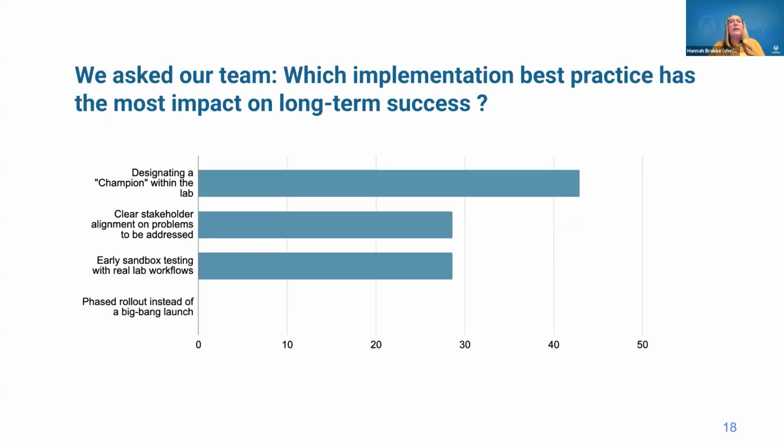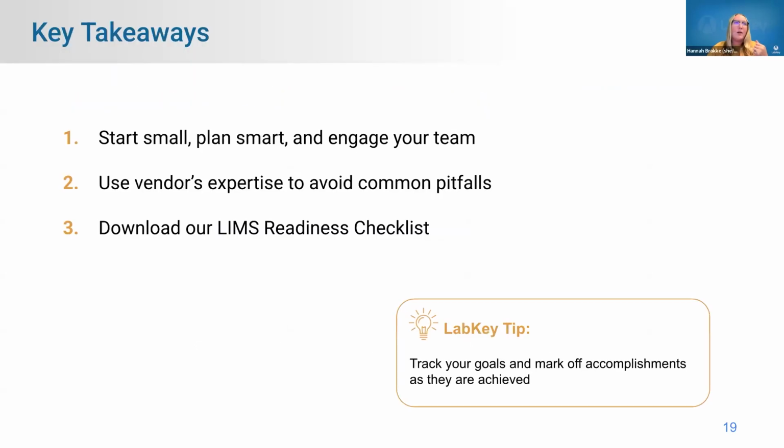And so the last thing here as we're closing, I asked our team as well, what has been the best implementation best practice that you've seen success on? And for us at LabKey, it's really designating that internal champion. And so the better the partnership between your lab and the LIMS vendor, I think the more success the implementation is going to have, because people frankly on both sides get really invested. And so that's something just to take away for the folks that are working on the implementation right now.